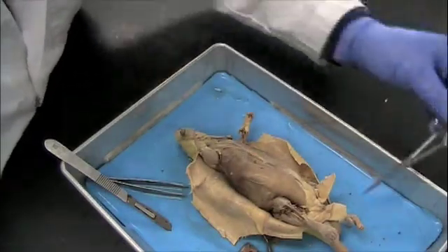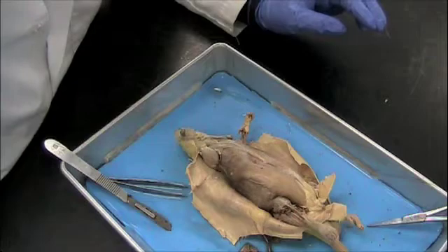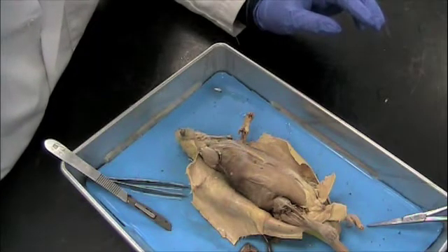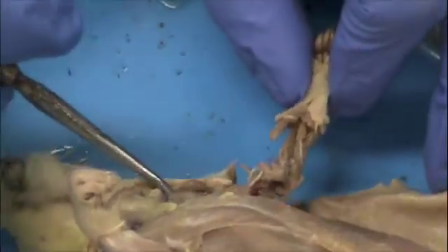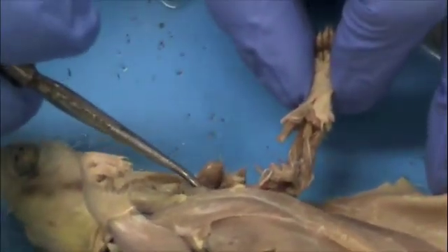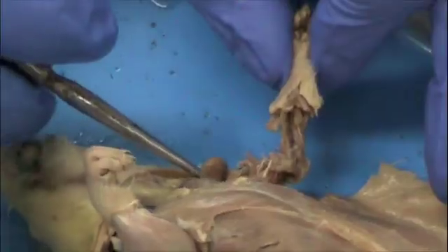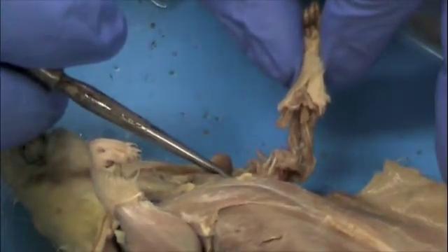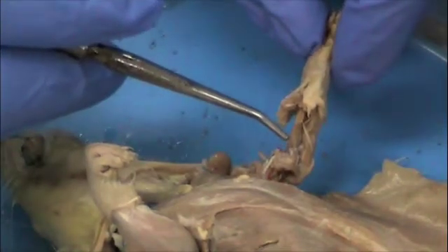We'll now look at the bones of the arm — they're very similar to the human bones. We'll be looking at three in particular: the humerus, ulna, and radius. Zooming in on the arm, I've exposed the bones by removing the muscles. We'll start at the shoulder and work our way toward the wrist. Connecting the shoulder to the elbow is the humerus, which is the larger single bone extending from the shoulder to the elbow area.